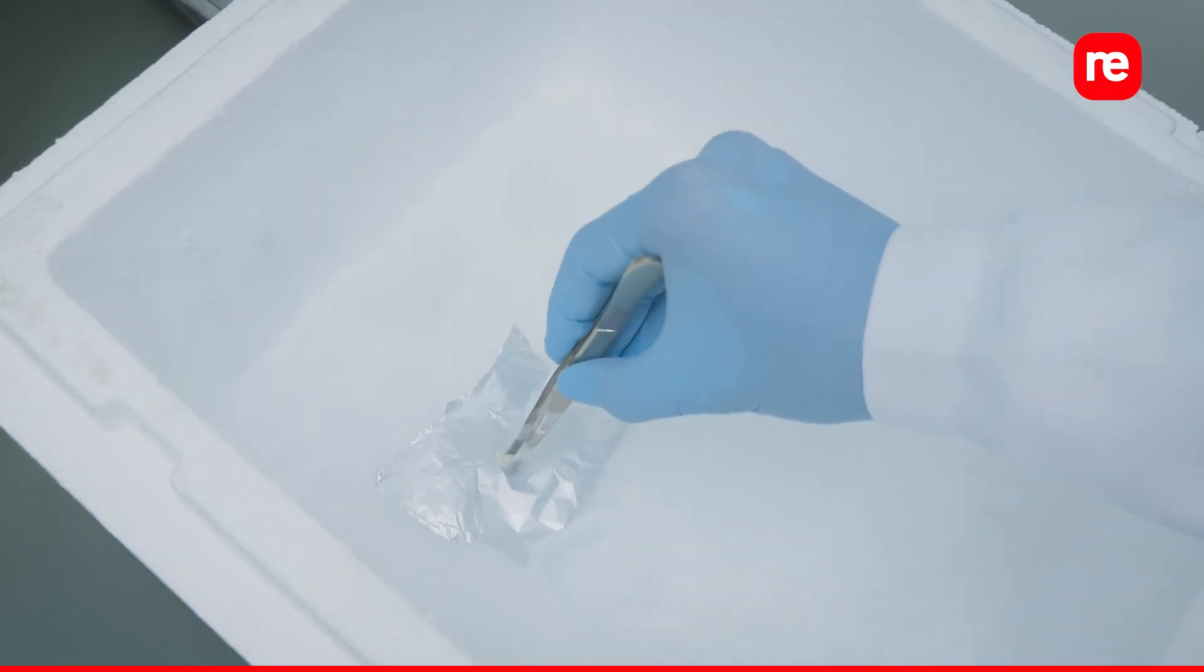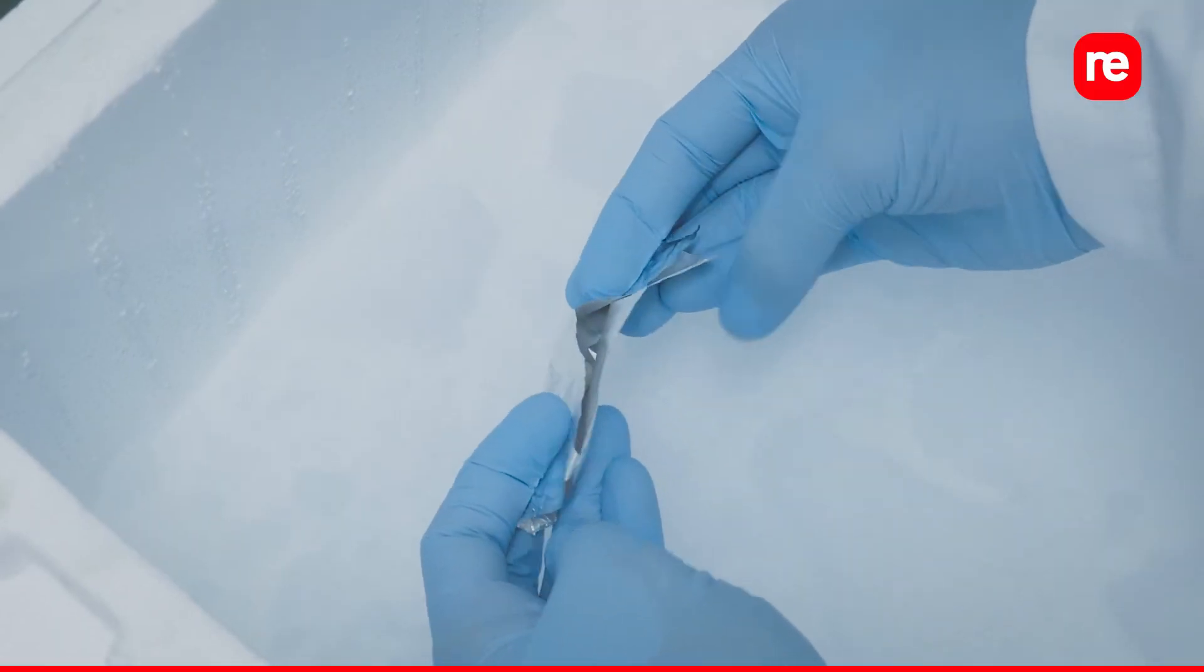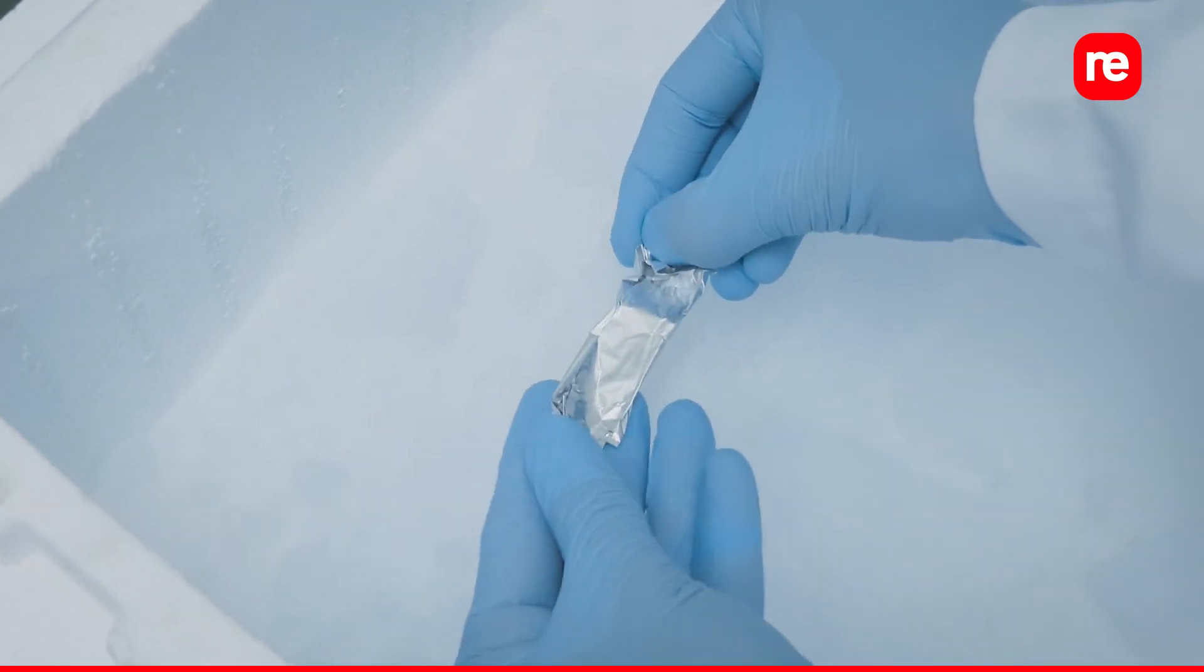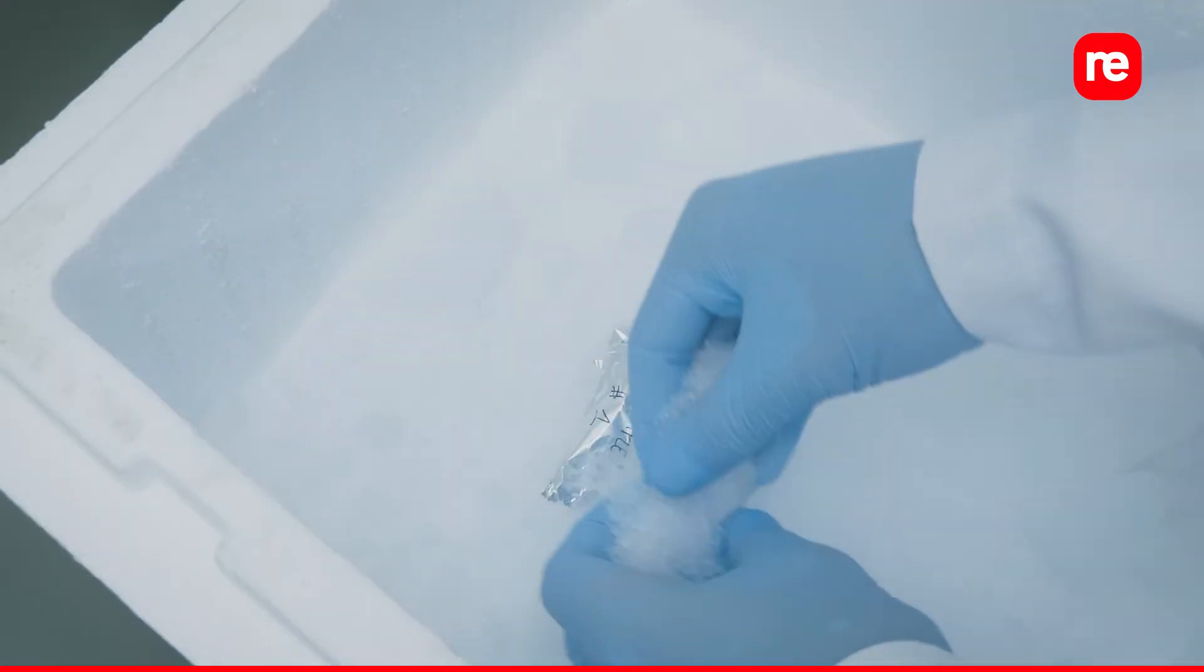Wrap the tissue in a pre-cooled and labeled piece of aluminum foil and store the wrapped tissue at minus 80 degrees Celsius until sectioning.